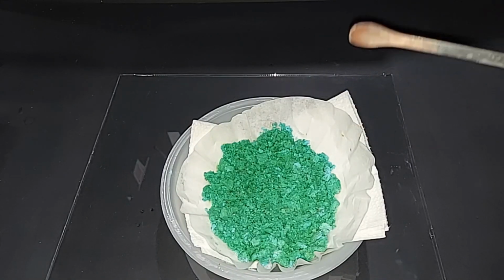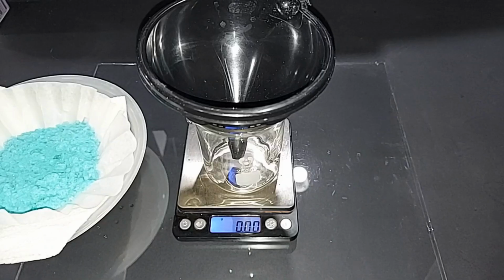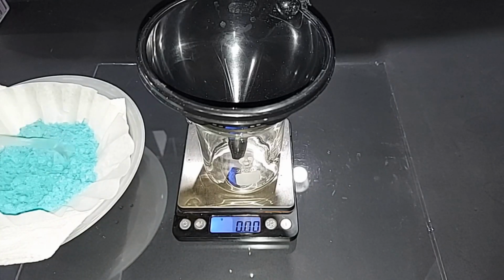This should dry pretty quickly, and I will come back and weigh it, but I don't think the weight will mean much as far as the stoichiometry goes, because we took part of it, a third of it, for the copper 1 chloride demonstration. Our copper 2 chloride is completely dried and ready to weigh.